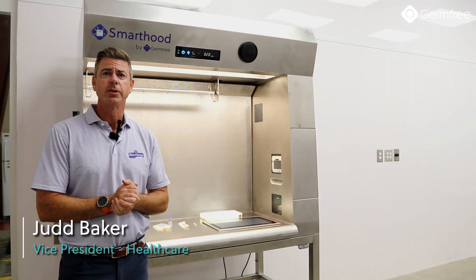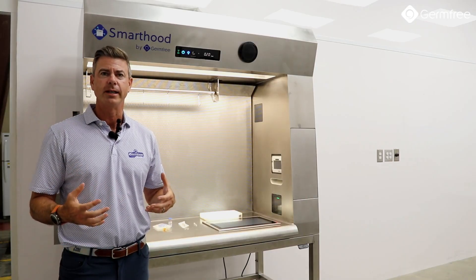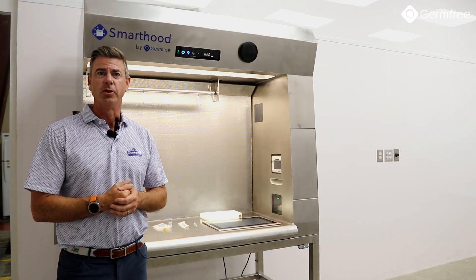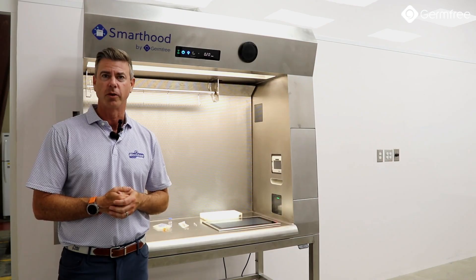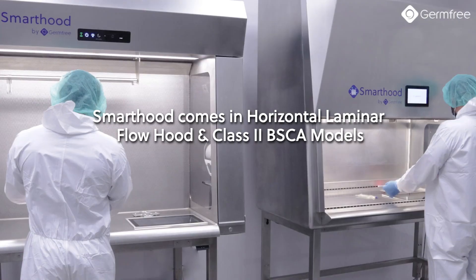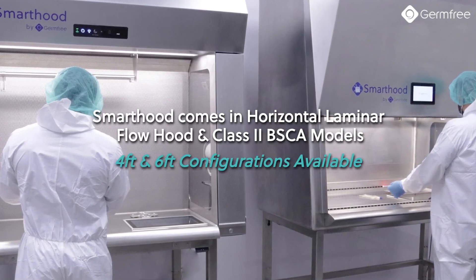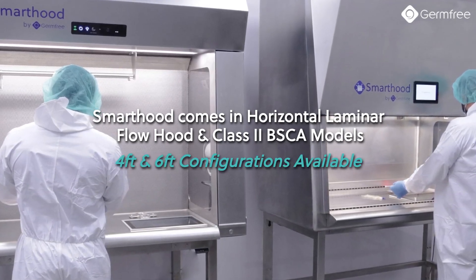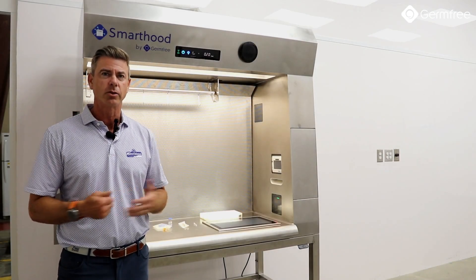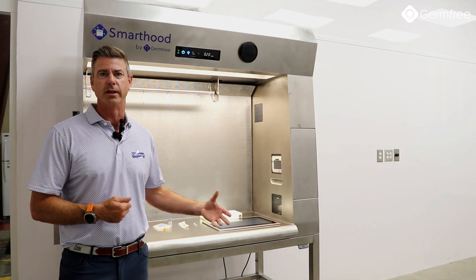Hey, I'm Judd Baker, Vice President of Healthcare here with GermFree, and what I want to do today is introduce you to the generally available version of our SmartHood. SmartHood is available in four and six foot versions and a laminar and a biological safety cabinet. I'm going to run a quick demo and show you through the features of SmartHood, but first let me tell you exactly what it is.